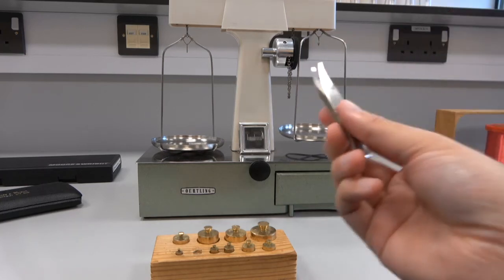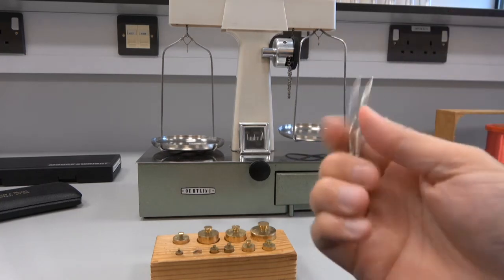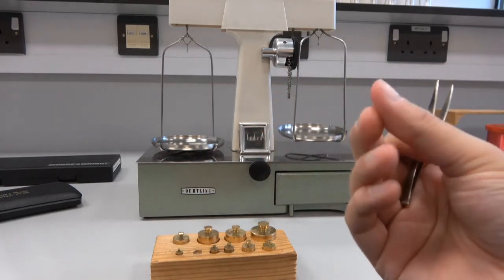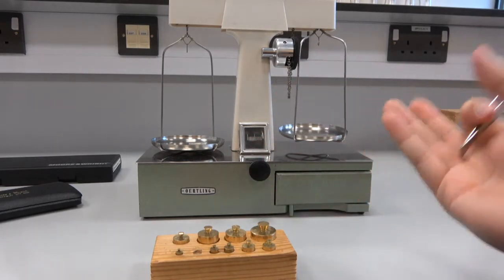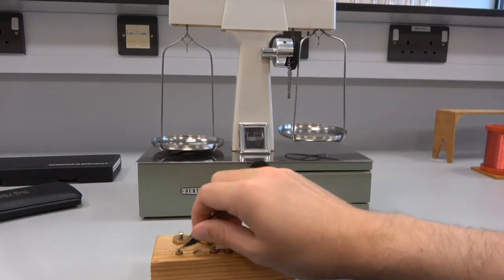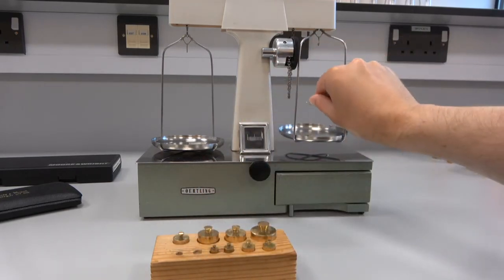So let's put that on. So two grams is too light. Now, the reason we use the tweezers is because our hands usually have oil on them, and it can affect the accuracy of the masses we put on.